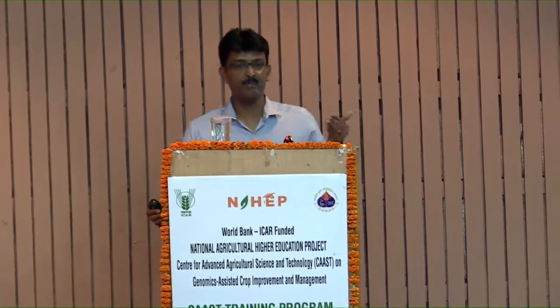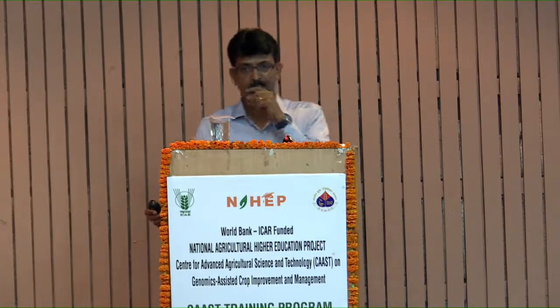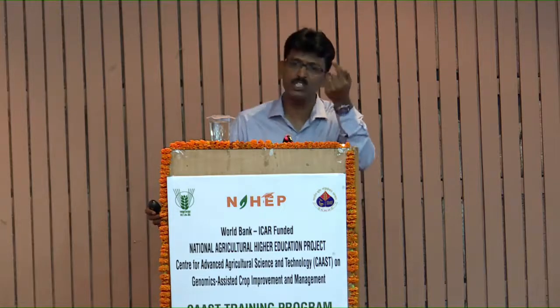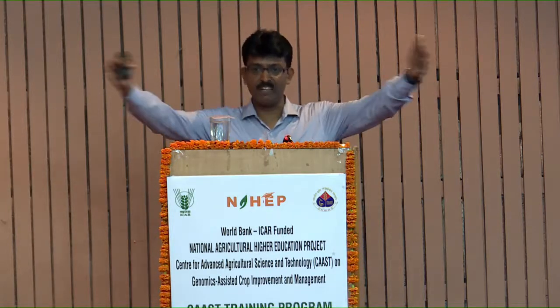Suppose you are developing a qPCR-based quantitation of some genes in insect. Take any one insect gene, say COX. COX is the target here, and the COX gene has a length.